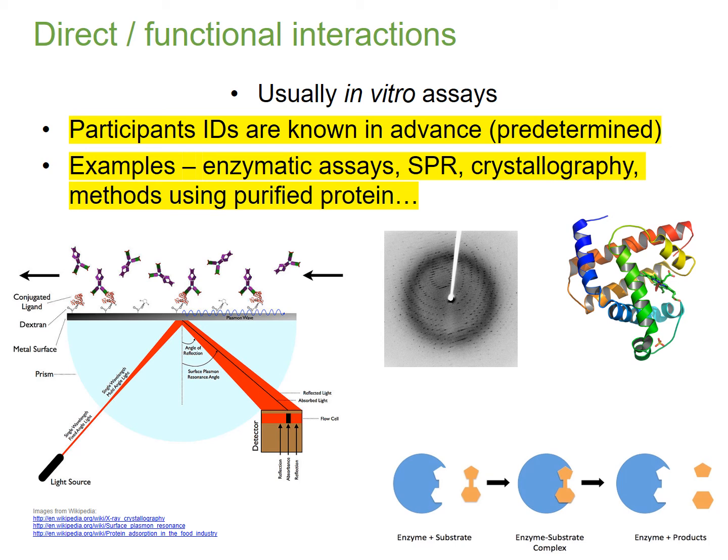And then here's a model of the enzyme and the substrate complex here. And you can figure out the different interactions, and you have a detector looking at the different interactions under different conditions. You can see the enzyme and substrate separate, you can see them together, and you can see the product and the enzyme back. Okay, you can detect those.